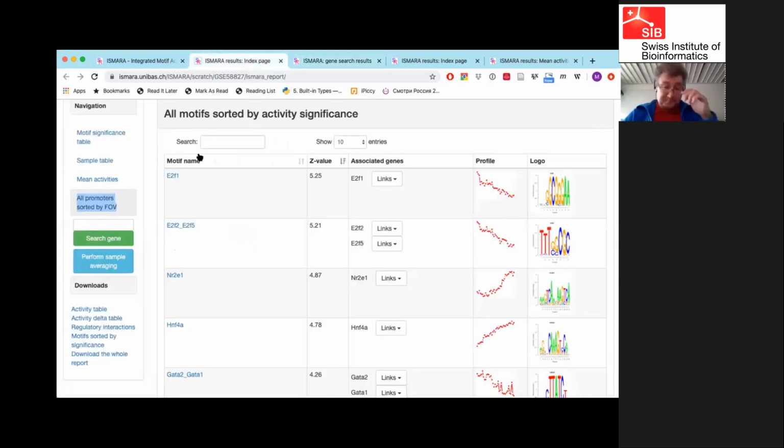And now, if we go to this third page, it provides a quick way to access these pages for a certain gene of interest. Before, you could select genes on the basis of fraction of explained variance, mean expression, or variation of expression across the samples. Here you can simply search for a gene by name. I had an example, wait a second, I will find it.